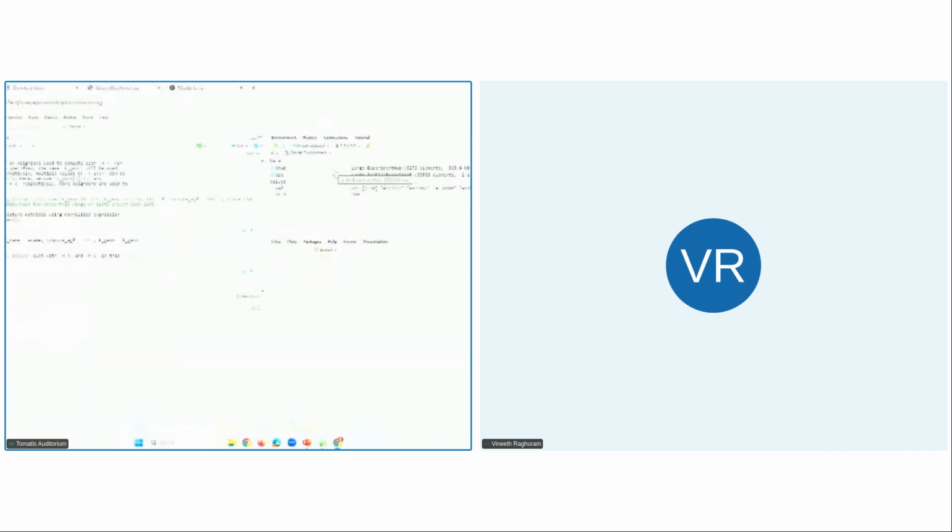All right, so I'll be walking through two demos today, illustrating some of the concepts that Vipul went through in terms of parameter selection and especially multi-sample analysis and batch correction. This is available on the workshop, so you should be able to spin up a server if you want to follow along. It's also on GitHub, and you can refer to the main package repository for our vignettes. I'll demo a standard workflow and some of the relevant parameter choices.